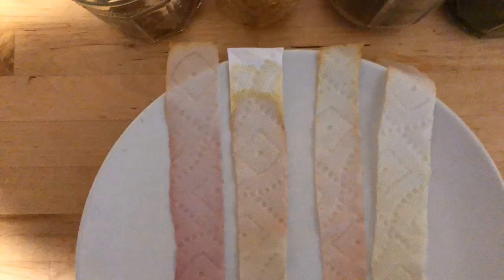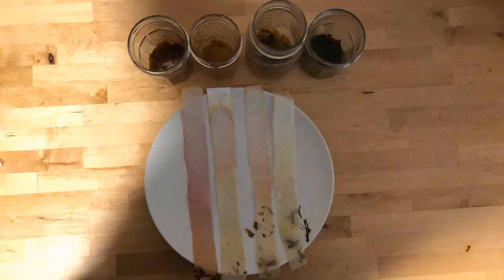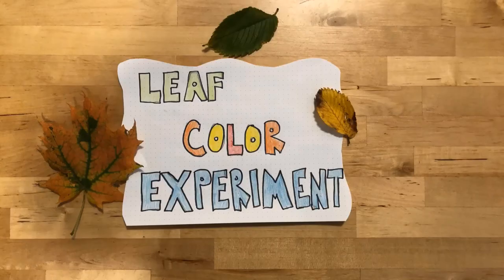This experiment of separating the chemicals onto paper is called paper chromatography, and that is our leaf color experiment.